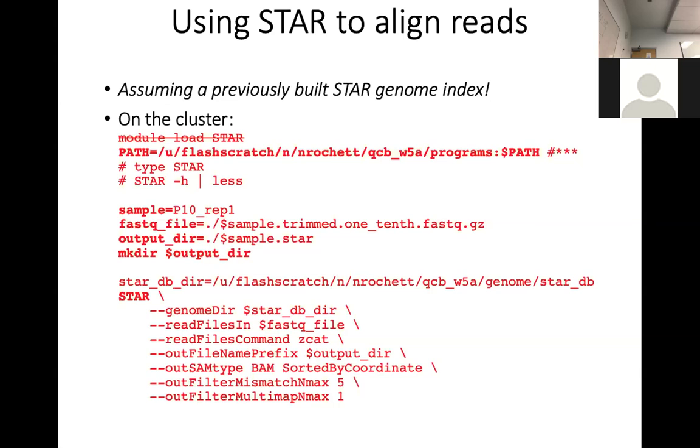So you just can copy it. The program, you have to use it or copy it, right? Because we're just using it as long as this is reading the program. You see the program. So it's fine. And then you can just do it.